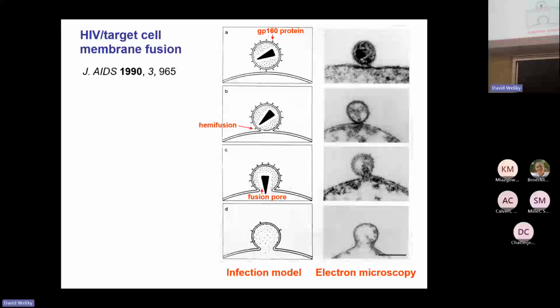For most of the time that I've been at Michigan State, one of the large projects in the lab has been understanding the joining, or the terminology that's used is fusion, of the membranes of envelope viruses with those of the target cells. So envelope viruses are a large class of viruses, including many viruses that cause important human diseases. For a long time, the highest profile ones were HIV and influenza. Now, much more topical, is the coronavirus, which is an envelope virus. Zika, measles, and some cancer viruses are too. And what they have in common is a membrane that they pick up from a host cell when they leave that infected host cell.